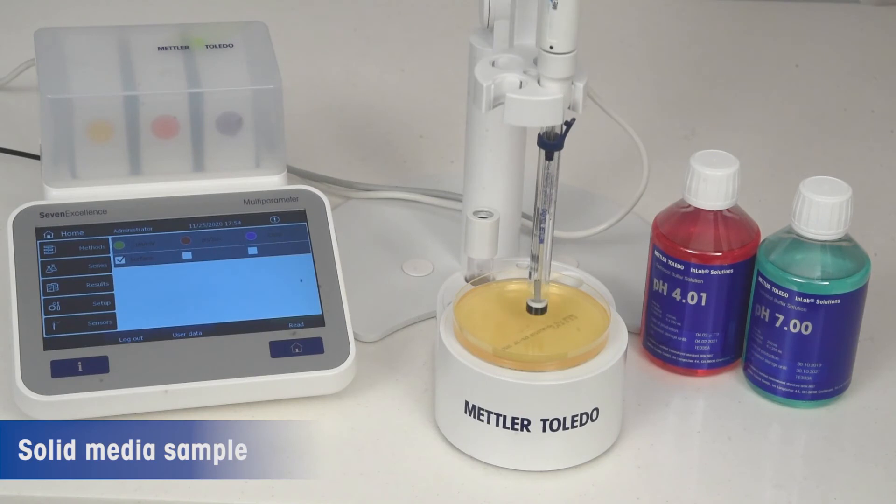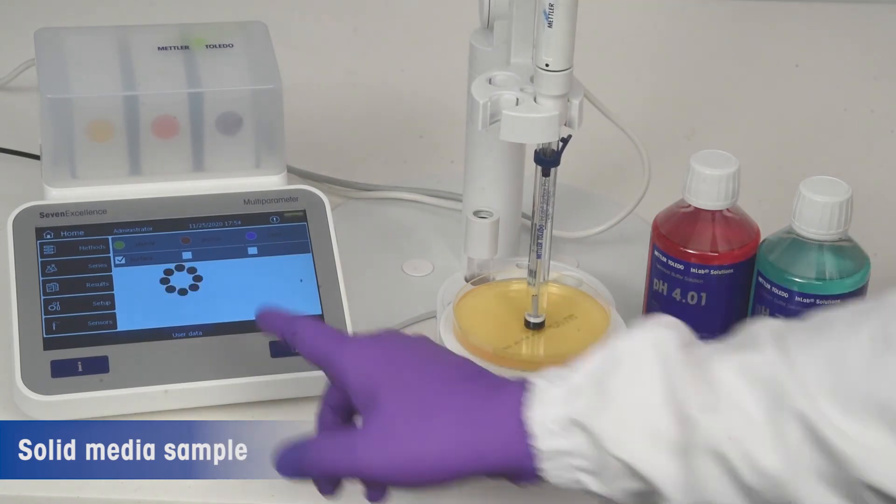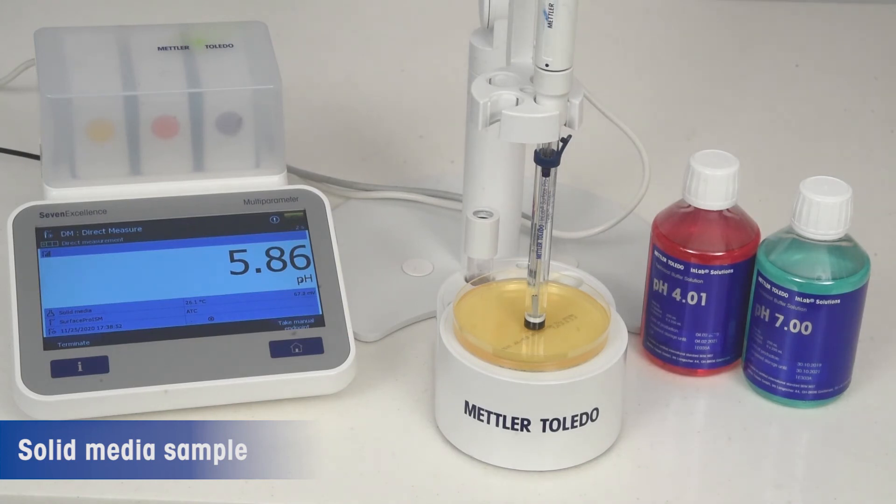For sample measurement using the InLab Surface Pro ISM, take the agar plate and simply touch the sensor tip to the media to measure the pH of the samples.